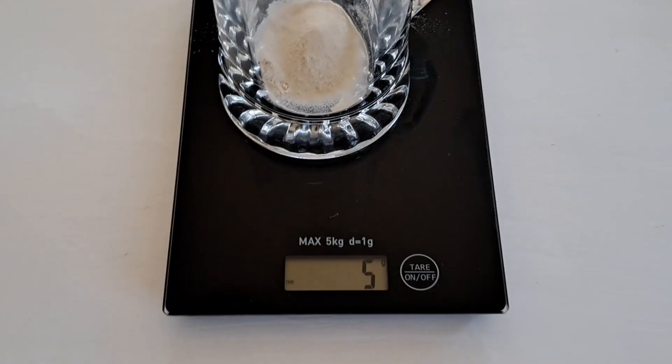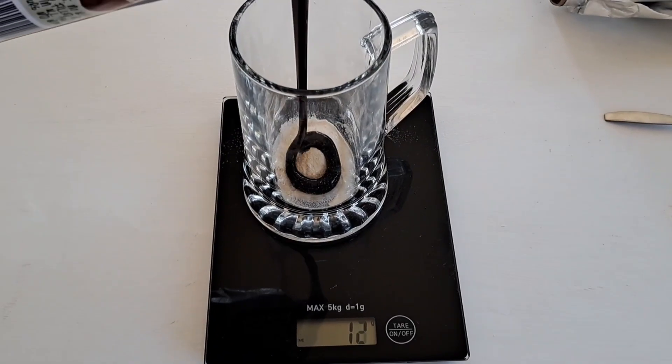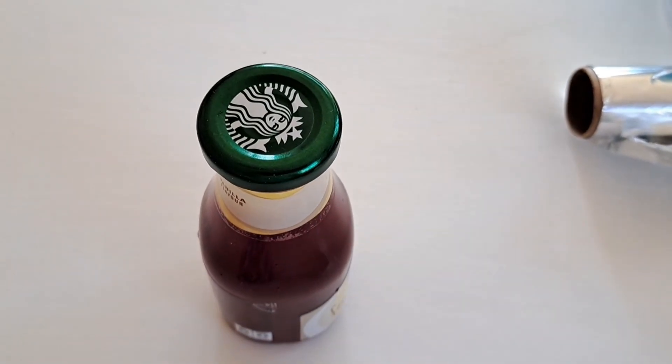Now let's make the LMEA. I use a scale because it's easier. I put 5 grams of agar agar powder in a glass. If you are working with powdered light malt extract, add 10 grams; if you are working with liquid light malt extract, add 15 grams. I add 250 ml of boiling water — I choose 250 ml because that's the size of my bottle. If you need more, just double the recipe. Add food coloring, mix everything together making sure there are no granules, then pour it into the bottle and put the lid on.